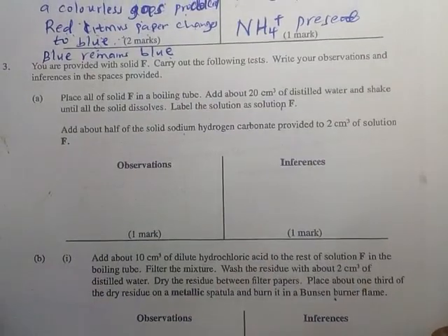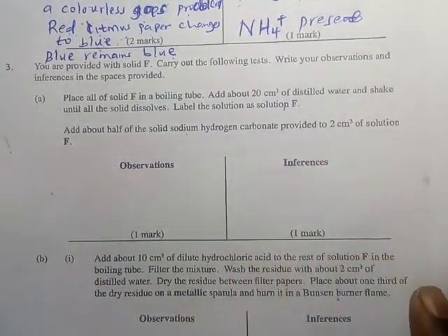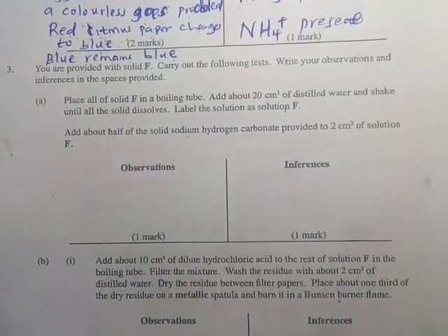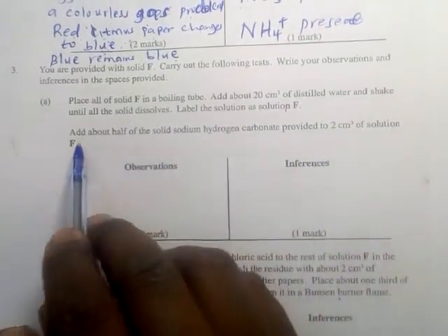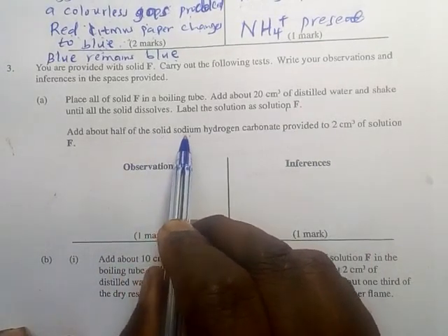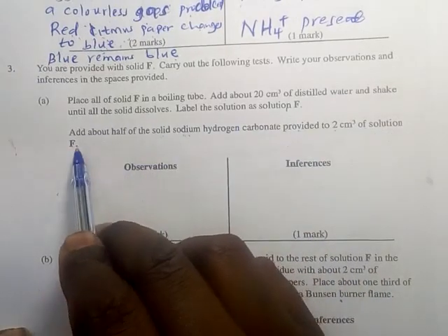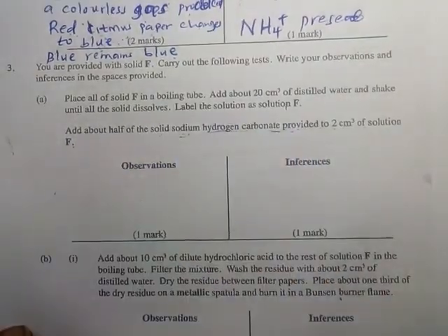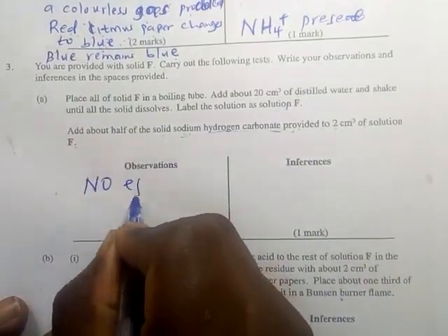So you need to know now this one is organic. What we were dealing with previously is inorganic qualitative analysis, and this one is organic. So now we have solution F. Add about a half of the sodium hydrogen carbonate provided to 2 centimeters cube of solution F. Whenever you are adding sodium hydrogen carbonate, expect effervescence or no effervescence. So here there was no effervescence.